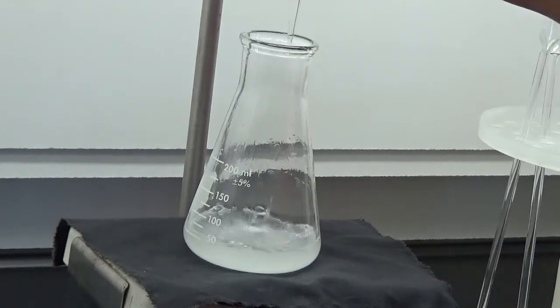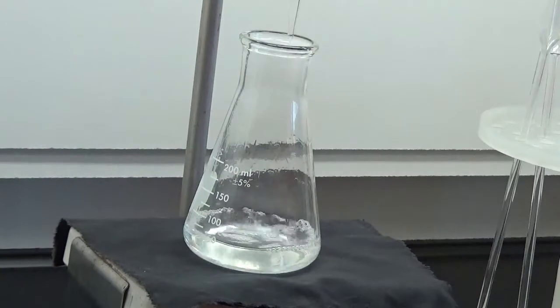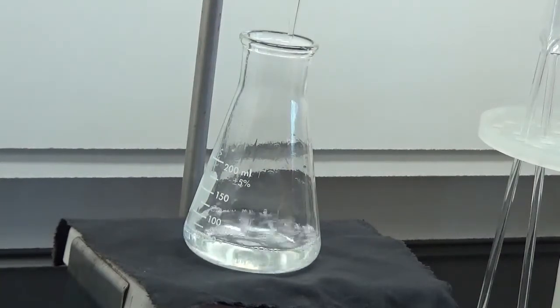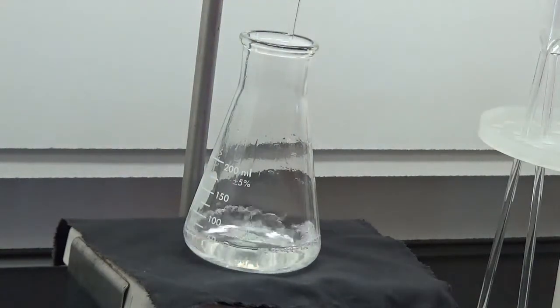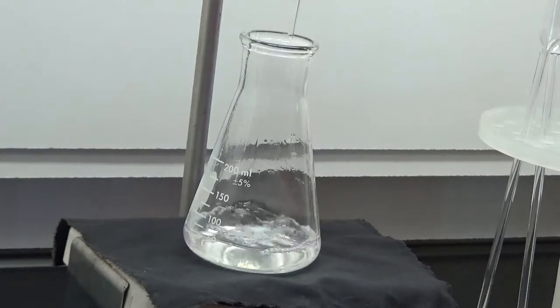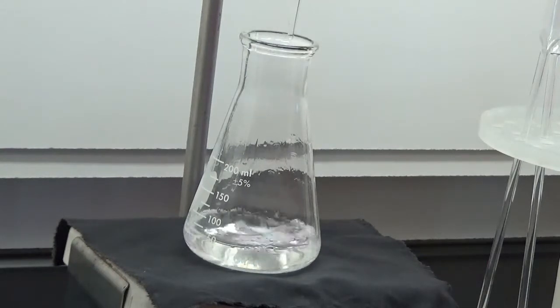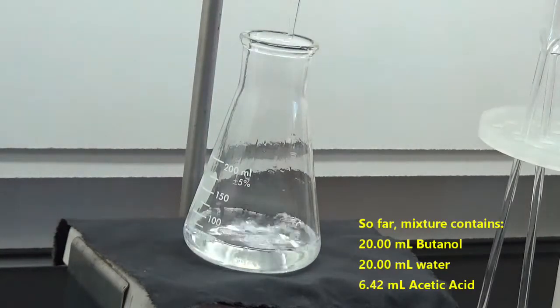I'm just staring at it. It's getting close. I think it's getting close. Look at that. Cleared right up. Wow. It's really cool. I guess that's why I'm a chemistry geek. So this is 6.42. It's just about a milliliter.